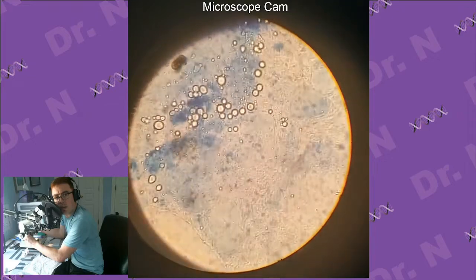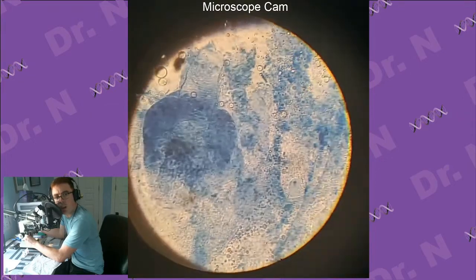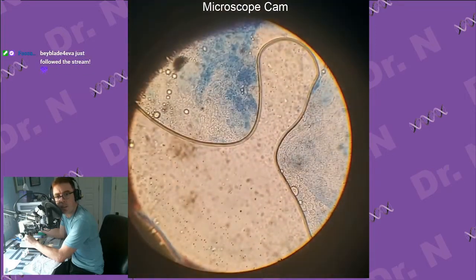So every time you're seeing some of this darker color, that is usually a cell's nucleus.